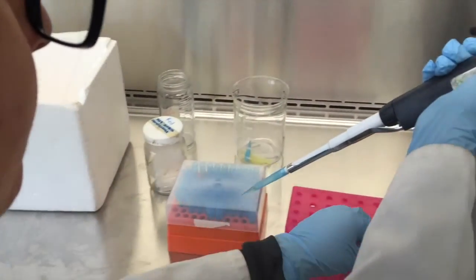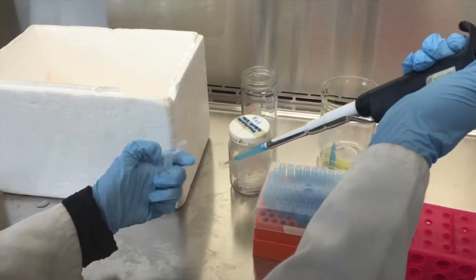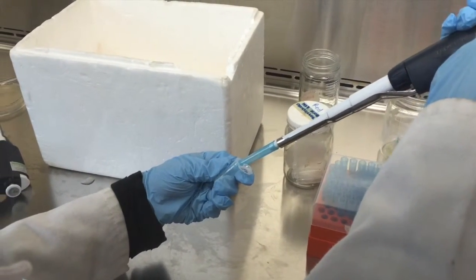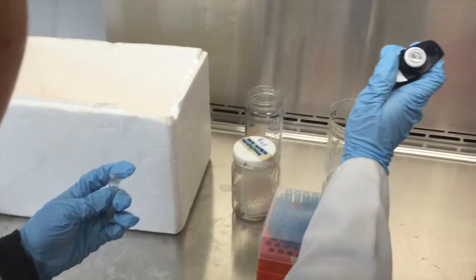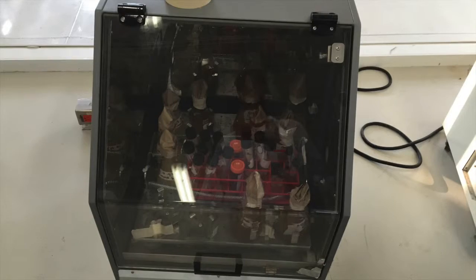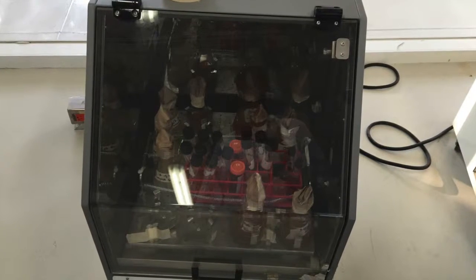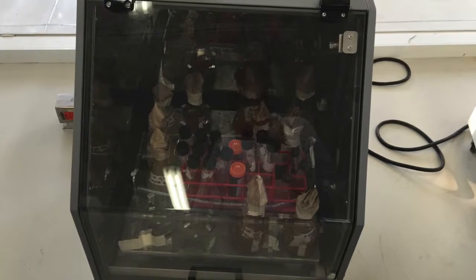Then they were incubated in ice for 10 minutes, and then they were introduced in a water bath at 42 Celsius degrees during 45 seconds in order to produce a thermal shock. 300 microliters of SOC medium were added and then the sample was incubated at 37 Celsius degrees during 30 minutes with shaking.